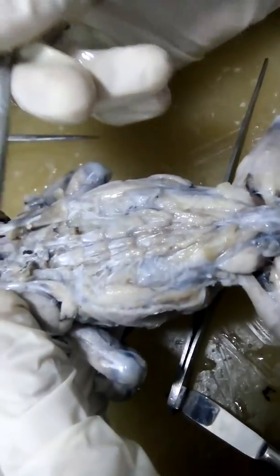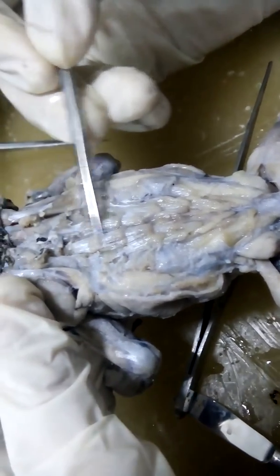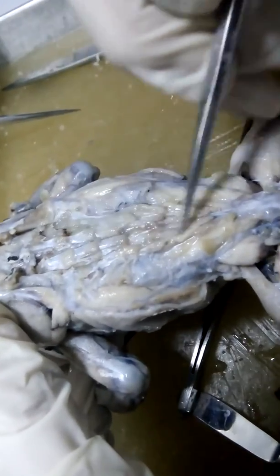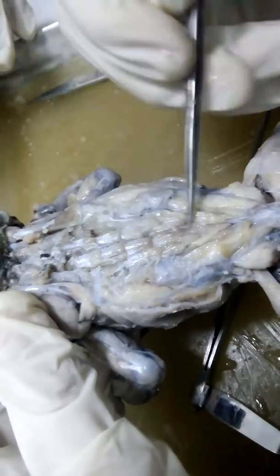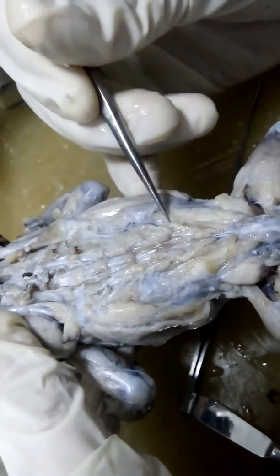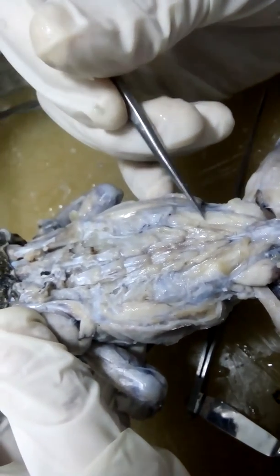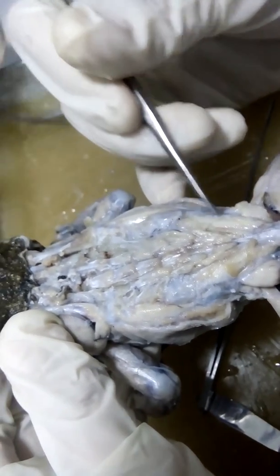So, proceeding to your dorsal back portion here, this would be your longissimus dorsi, from the word longissimus dorsi, dorsal. And below it, posterior to your longissimus dorsi, lateral to it again, this would be your coccygeosacralis, because this would be connected to your sacral vertebra.